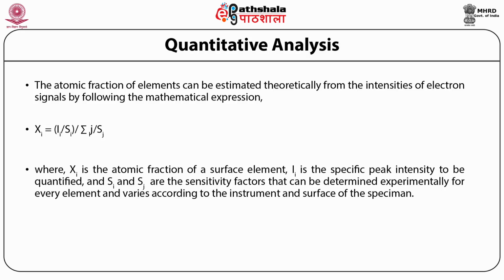The intensity of AES peaks is considered as the peak-to-peak height in differential spectra. However, the peak-to-peak heights depend on the instrument resolution and the differentiation or modulation processes using computer software. This problem may be resolved by using the AES direct spectrum.